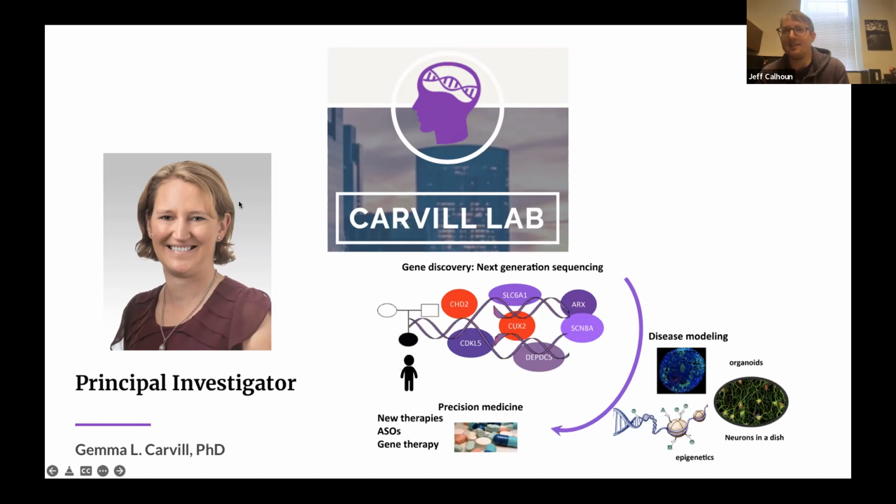I think the hardest part is I just learned how to do CRISPR-Cas9 for this approach. So trying to learn how to do the libraries that we need to do saturation mutagenesis, for example, I haven't gotten there yet, but that's what we're working on. I actually quite like Steve Elwood's saturation prime editing approach because we're mostly interested in missense variants. It's nice to have some premature truncation variants as positive controls, but we can do that with saturation prime editing too.